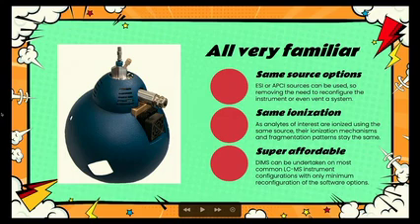There's no need to reconfigure the instrument. You've got the same source options. Unlike moving between, say, a REIMS system and an ESI system, which requires the instrument to be vented, between doing conventional LCMS ESI and direct injection ESI you don't have to do anything to the mass spec at all. There's no venting.